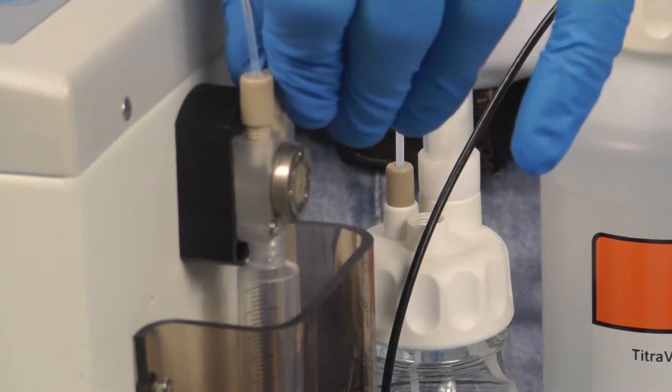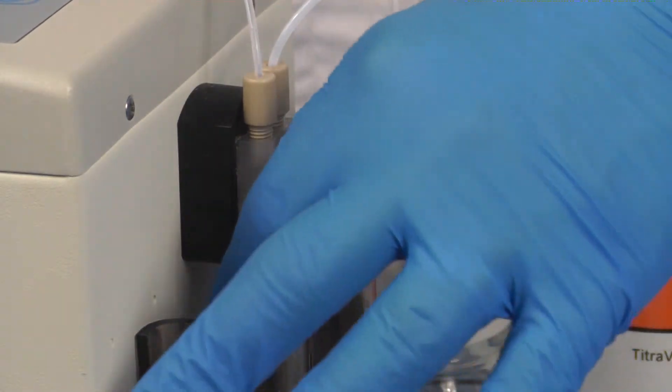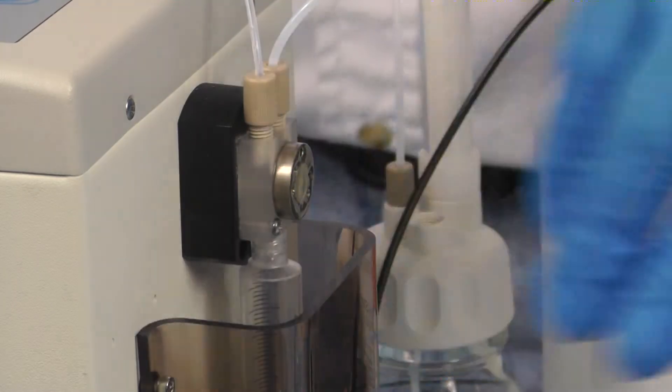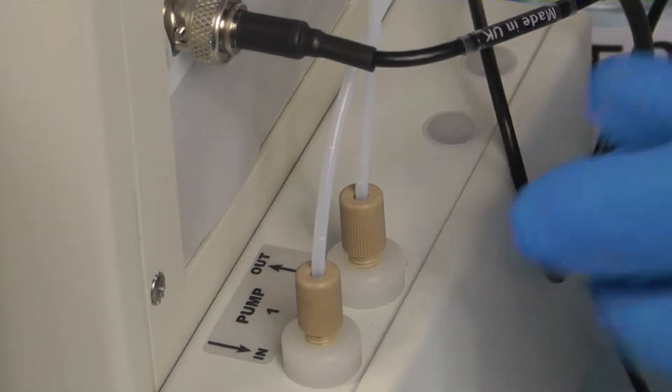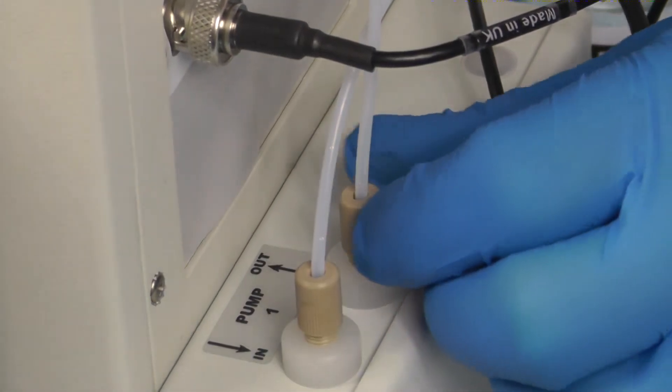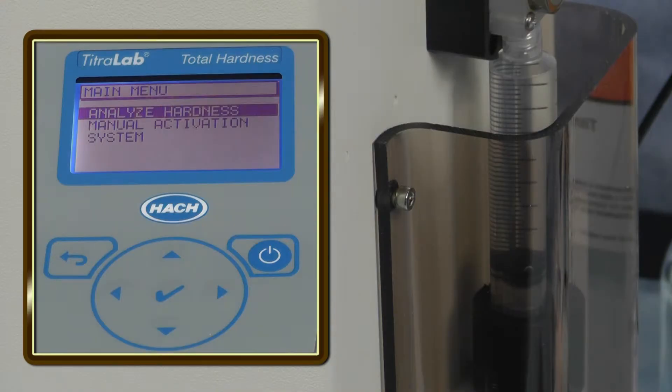Make sure all fittings and the syringe are tight. Prior to the analysis, prime the burette and tris buffer pump. This should be done once daily to make sure all air bubbles are out of the lines and you have fresh buffer being delivered into your samples.